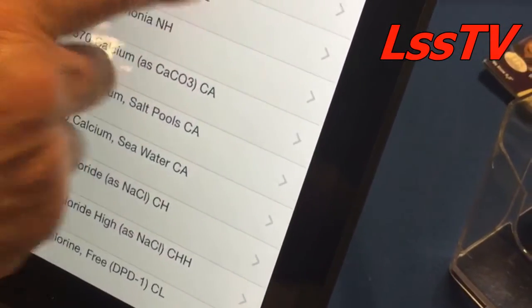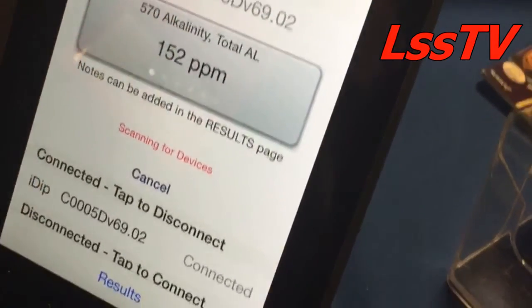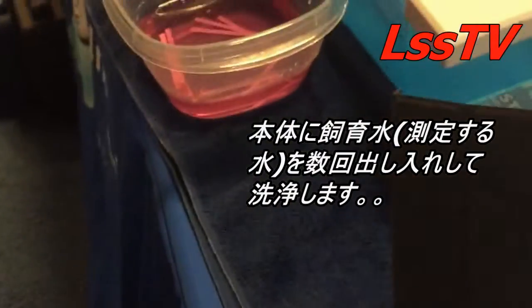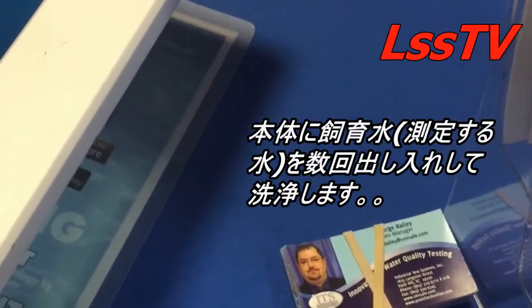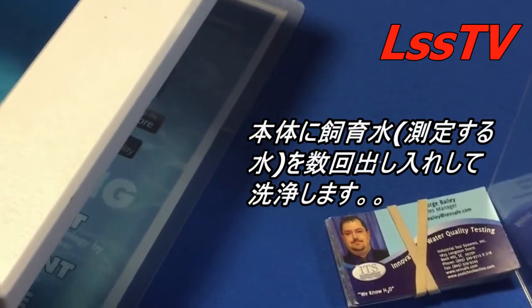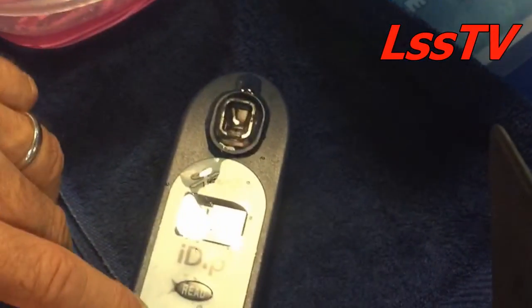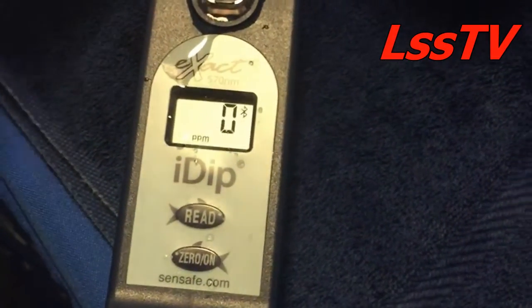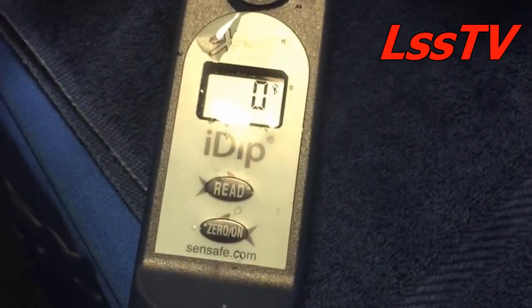Select test. I'm going to show you an alkalinity test — it is 570 nanometers for salt water. What I would suggest is taking a sample and pouring it in here, but I'm just going to dip it in here. Rinse it out three times, grab a water sample, and I'm going to zero it. This is in ambient conditions — I'm just doing a background of the water. If there's any discoloration or anything, it will compensate for it.